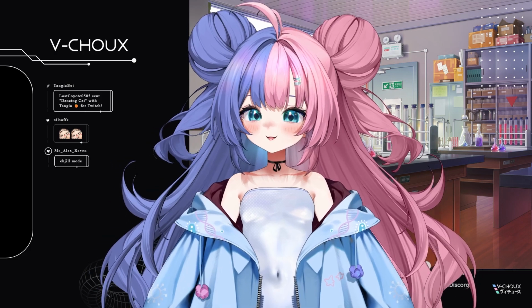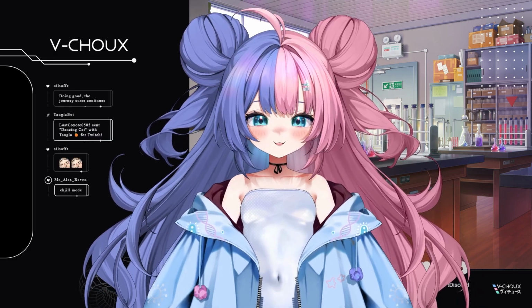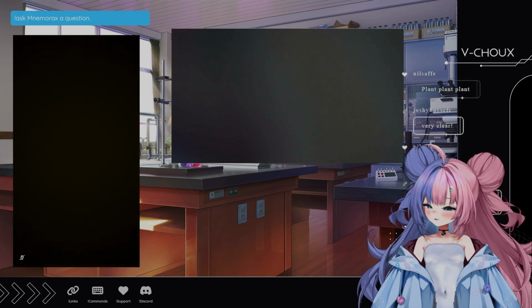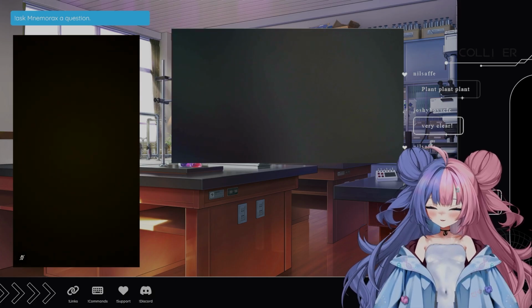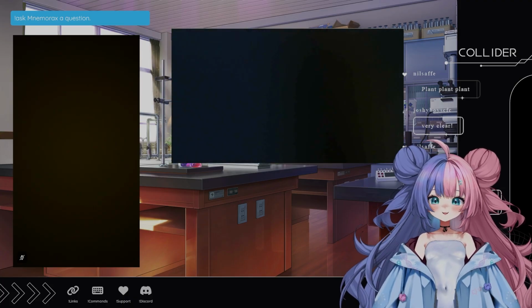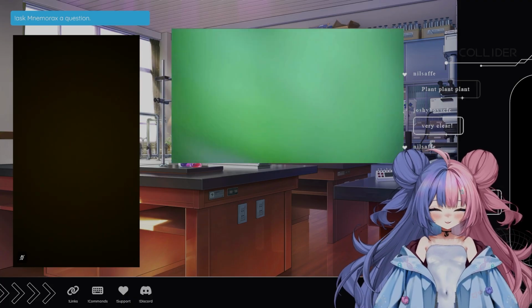Excited for the microscopy. Let's move this one and this one. So, first, we are going to observe a living daisy.